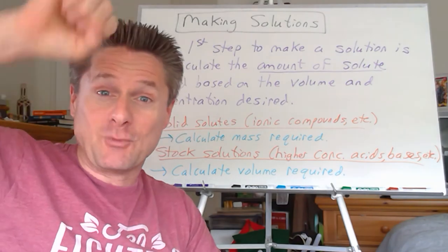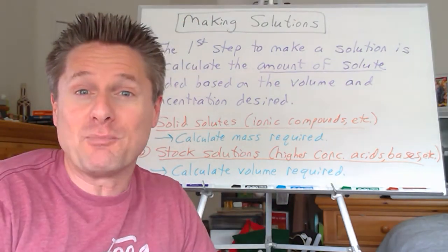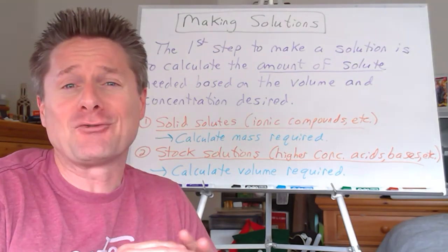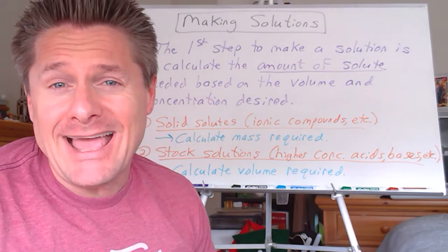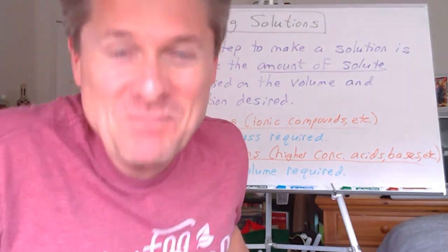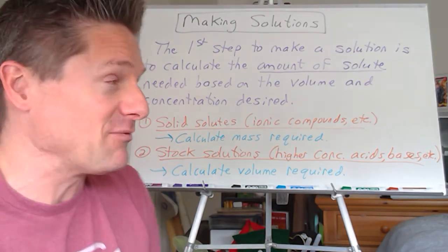I'll take that amount, squirt it in a gigantic jug at home, which is probably 4 or 5 of those bottles. So it just dilutes it down tremendously. Saves me a lot of money, doesn't taste that great, but you get what I mean. So we'll talk about how to do the calculations for dilution. I'm going to derive a really cool equation for you.